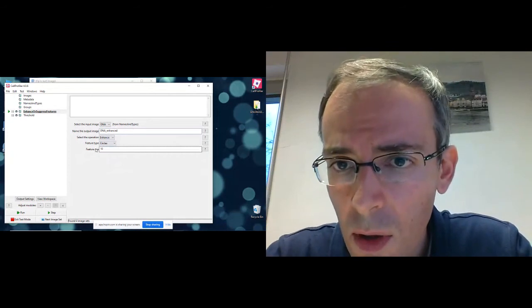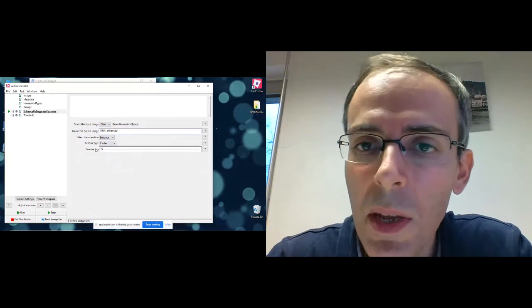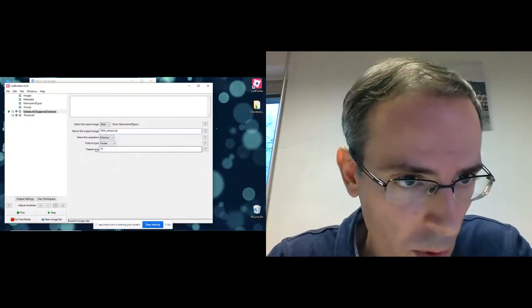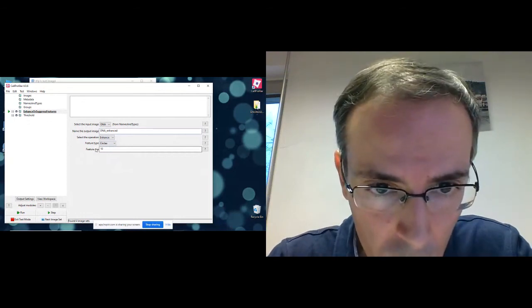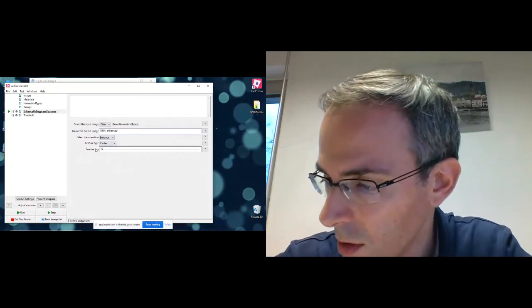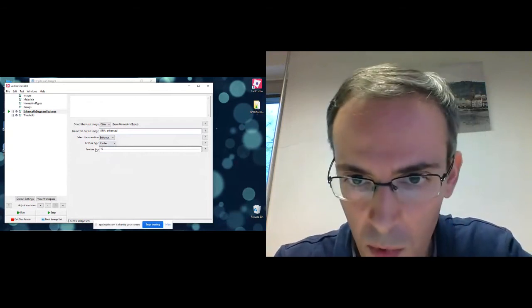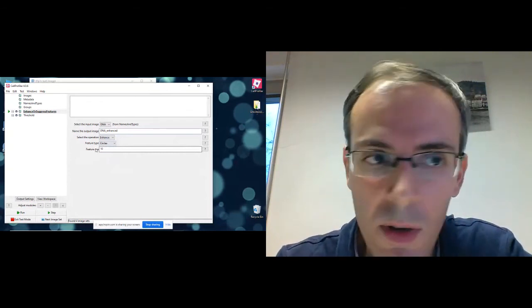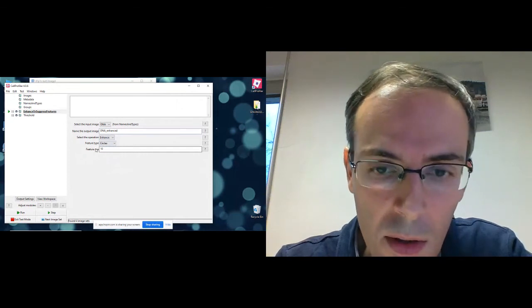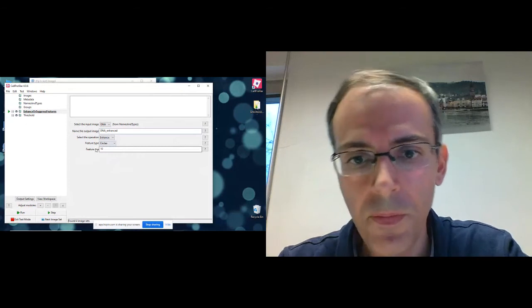In this case, the image is not being enhanced in a meaningful manner at all. So I found that if we choose speckles and provide a slightly larger size, this should provide a good enhancement of the image.